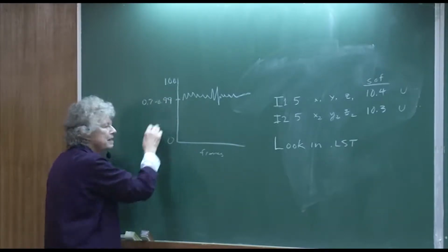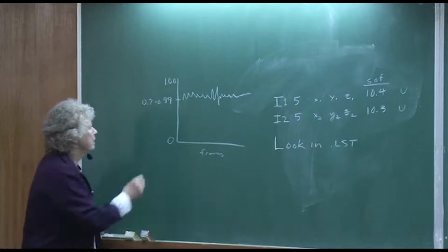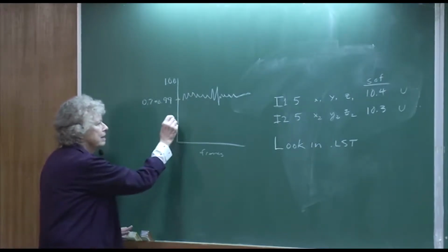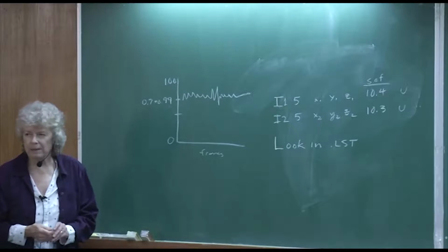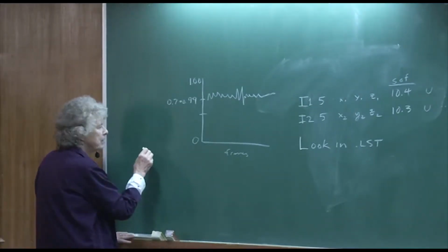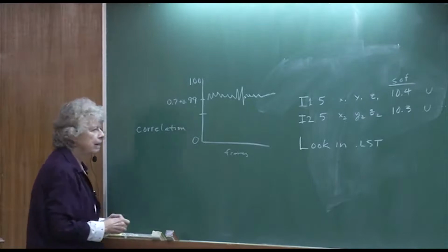I've actually seen things at 0.99 where it's really strong diffraction and a perfect crystal. That said, sometimes it's not that high. Sometimes it's more like 0.4. But if it's less than 0.4, I think you're very unlikely to get a very good structure. The correlation plot is usually on the upper left-hand side. I would keep an eye on that plot.